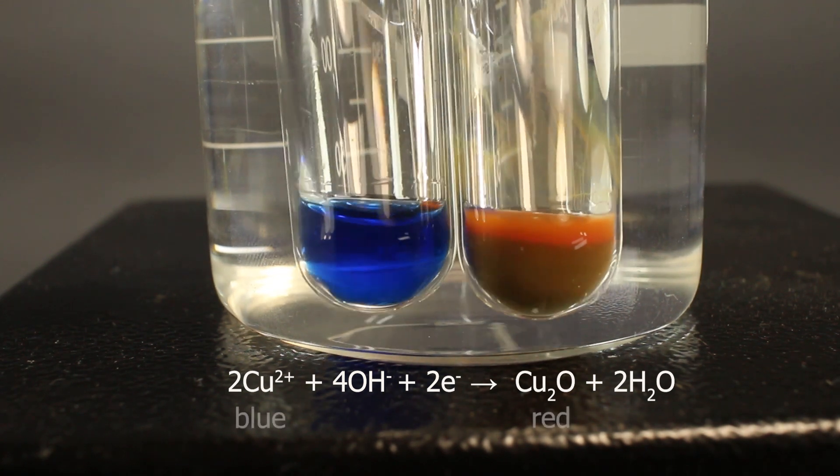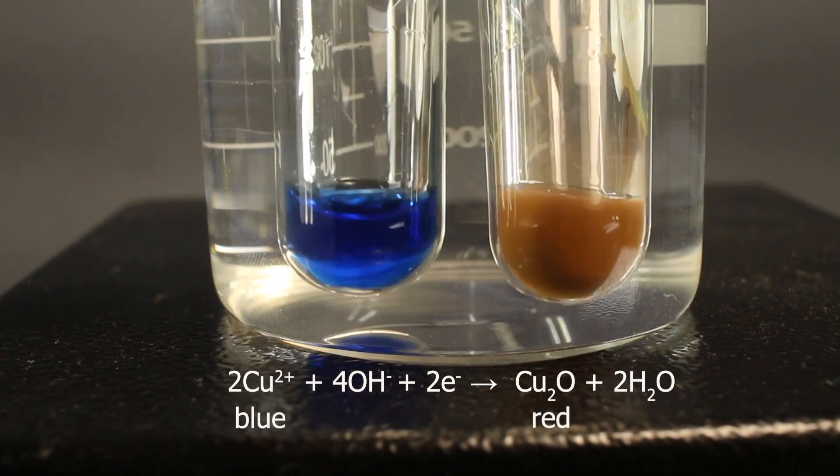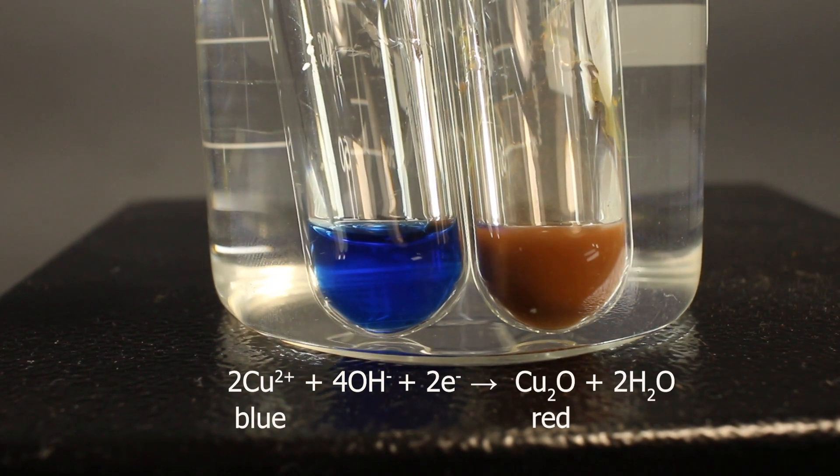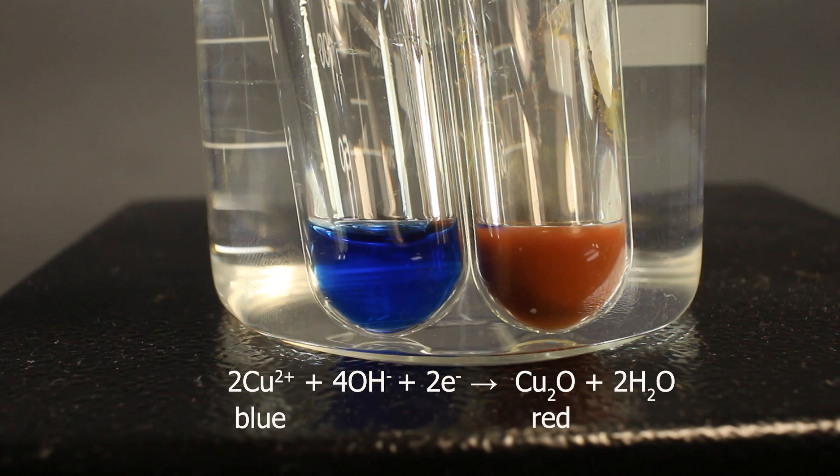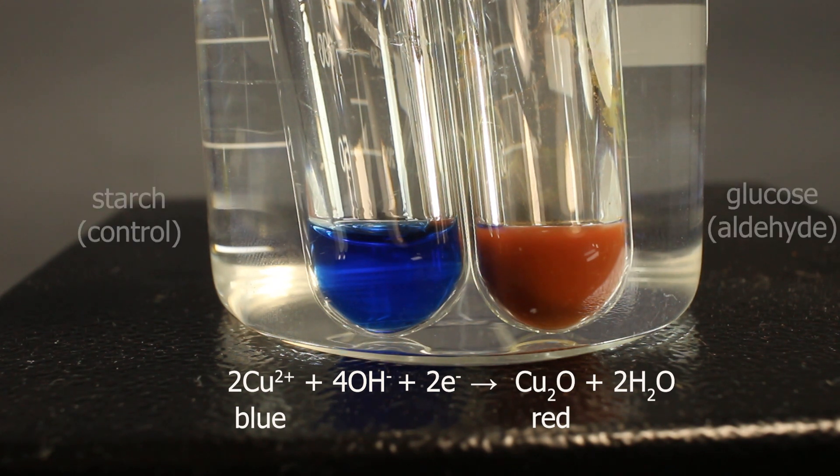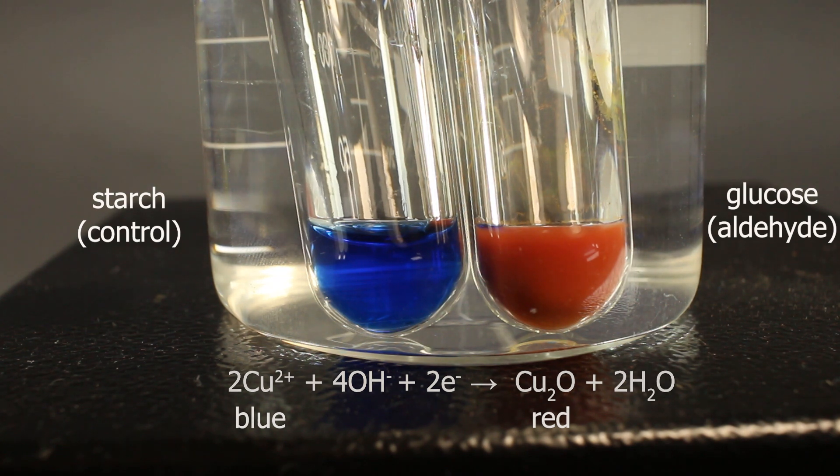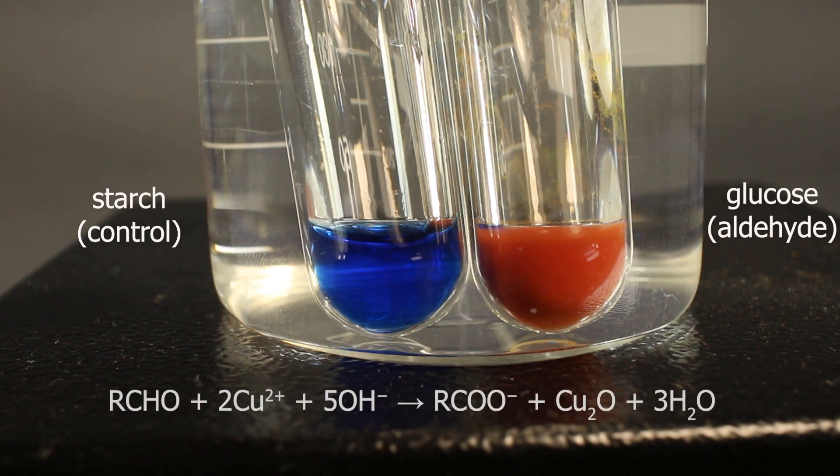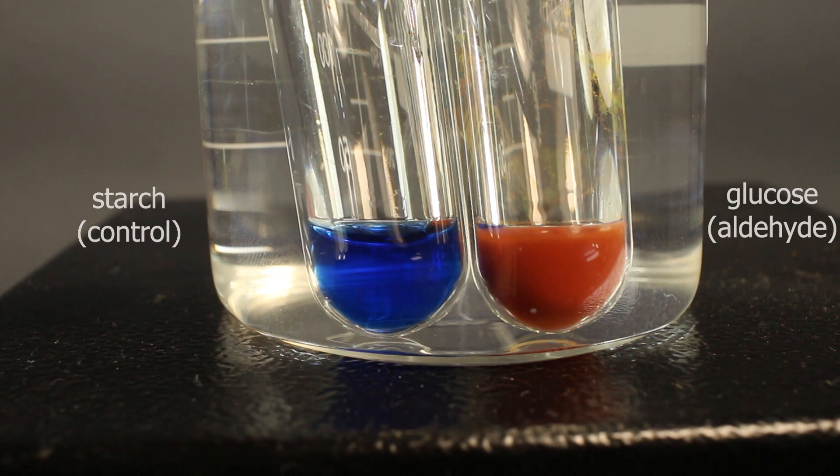It's very weak oxidizing agent, so our test is for very strong reducing ones, aldehydes. When copper 2 ions receive the electrons, one electron each, they turn into copper 1 oxide, which is brown in the beginning, or red if we run this reaction for long enough time.